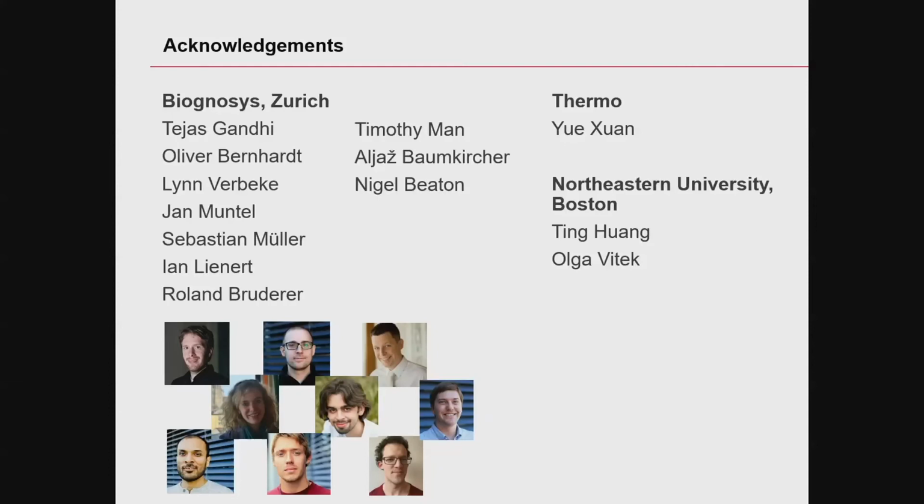That's basically what we have done when we did phosphoanalysis. You can do phosphoanalysis and it works, but you have to go through the interesting candidates manually and check whether everything is kosher if you want to be on the safe side, and it can certainly be improved, that's for sure.